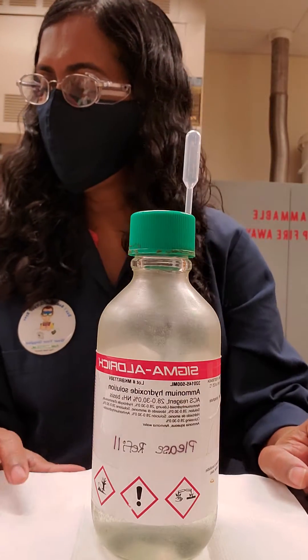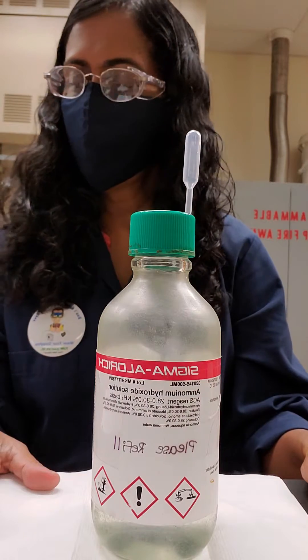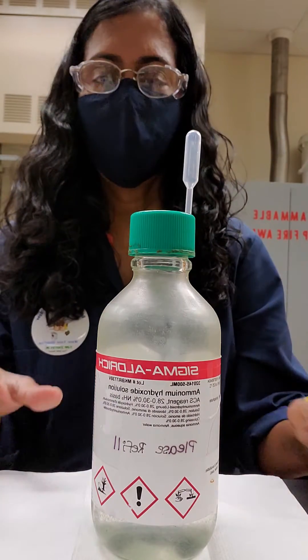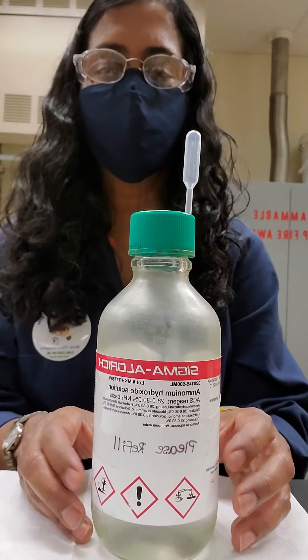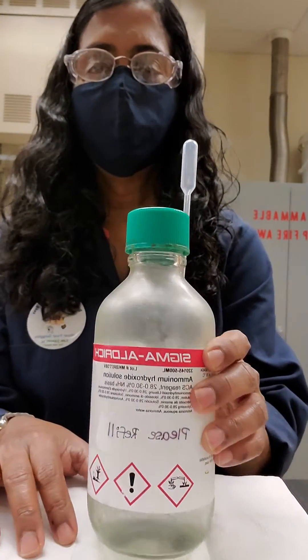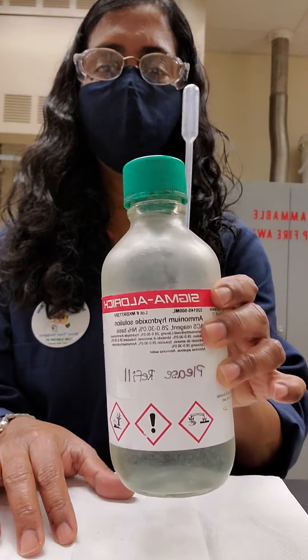We are on experiment number 5, the Ammonium Hydroxide Equilibrium. Here I have a bottle of concentrated ammonium hydroxide just to show you that it does not have much of a color — it looks like deionized water.